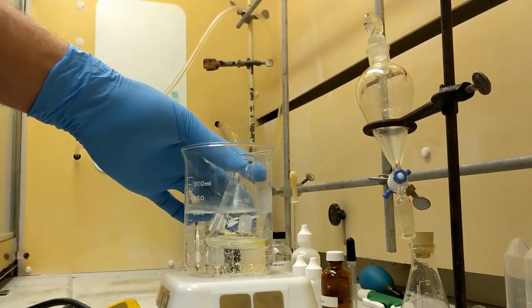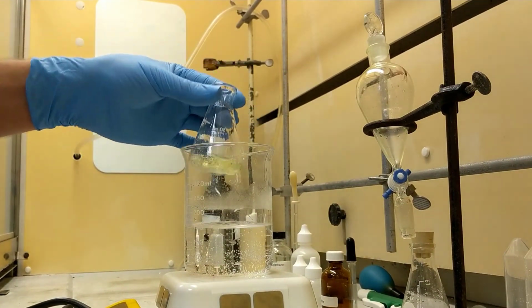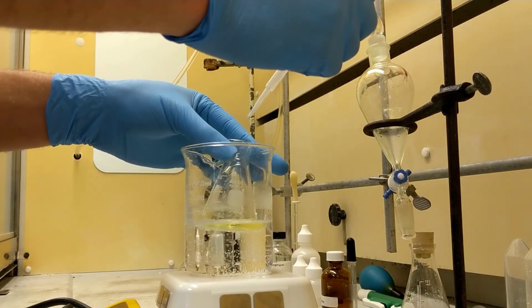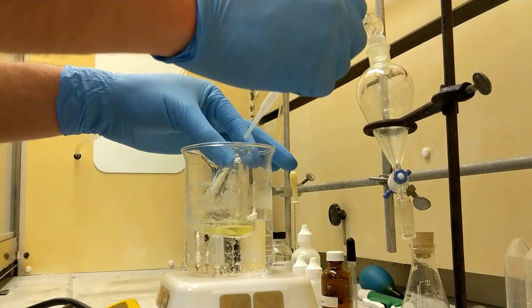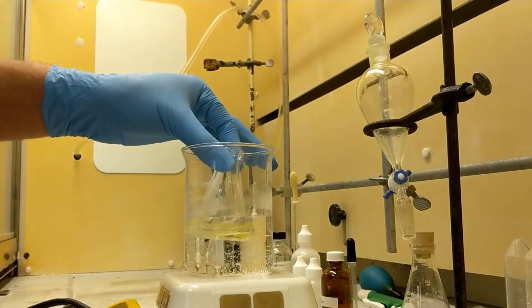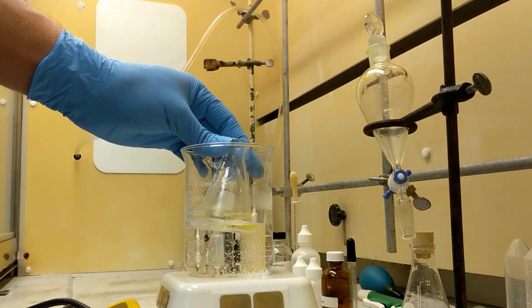Let's see what's going on. Yeah, there you go. So I'm just going to let that sit in there and add just a gentle stream of air and let it evaporate off, okay? You guys get the idea. See you in a second.